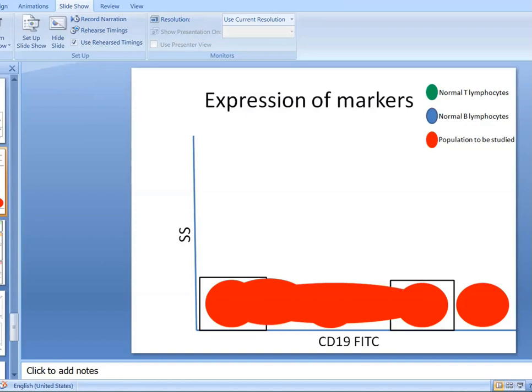Okay. So let's delete everything. Let's start from the beginning so that you will have clarity. So this is the software. This is an analysis software called Kaluza. People who want to try this can download the trial version, and I'll share the contact of a person who is related to this, the application person in the group. You can contact him, and he will help you in downloading the trial software, which you can use for 1 month. Okay. Now let me show you what the features are.